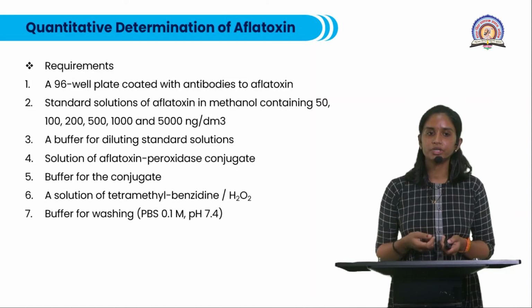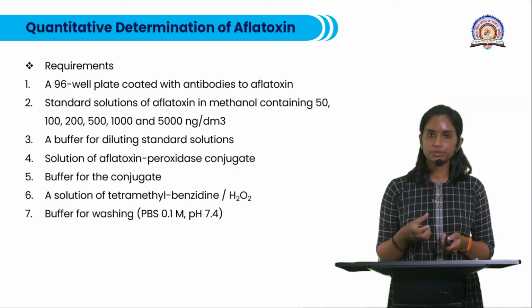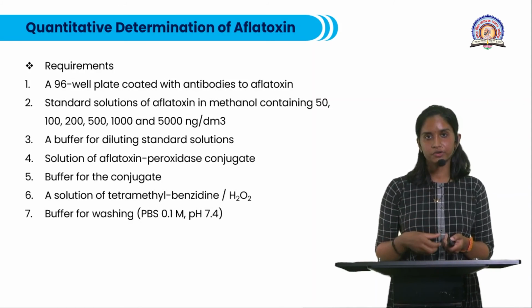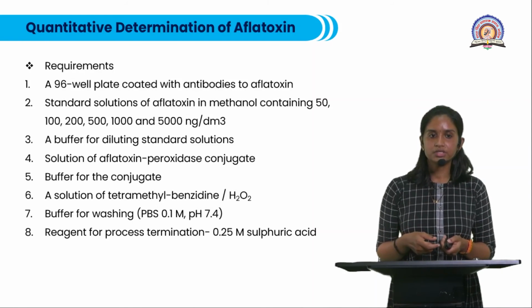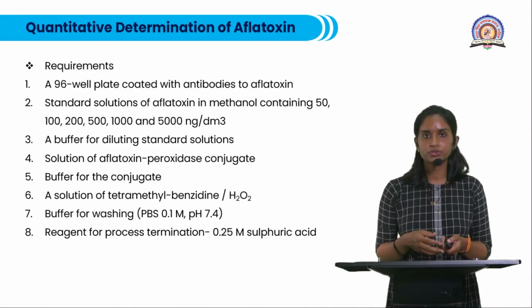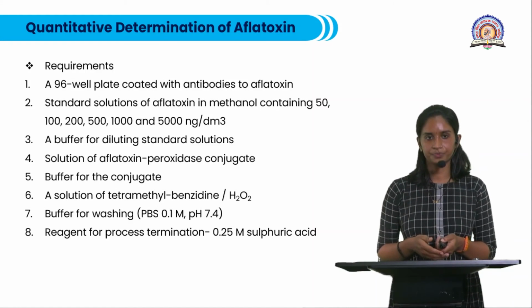Then you need a buffer for washing. Again, this buffer is also made for maintaining the integrity of the enzyme. And then you will require a reagent for process termination. That means to stop the enzyme activity at the end of this assay.